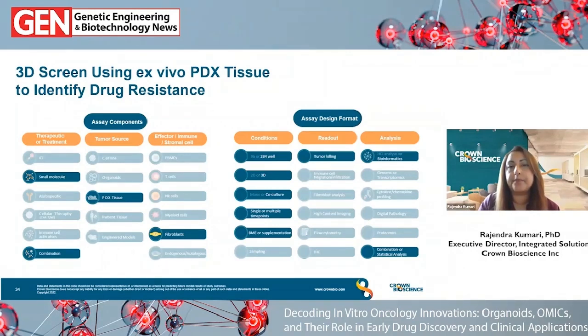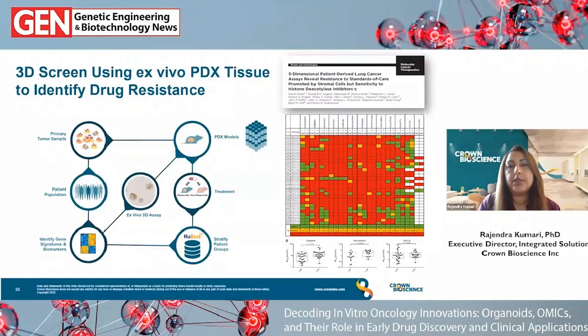So this diagram shows the typical cycle for PDX screening in vivo, where the PDX is generated from a primary tissue, initially done and then banked down to create a biobank, and then responder profiles are evaluated in vivo to generate those gene signatures and biomarkers. And this is quite a long process when it's done in animal studies. So being able to take the PDX material into 3D ex vivo culture is much faster, which is shown by the skip through the middle of the diagram.